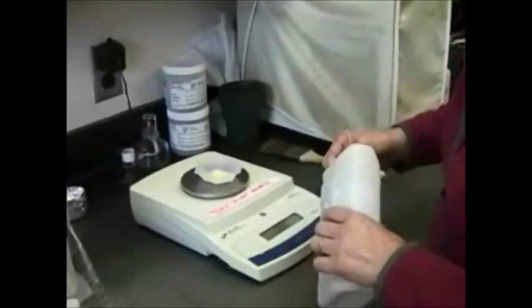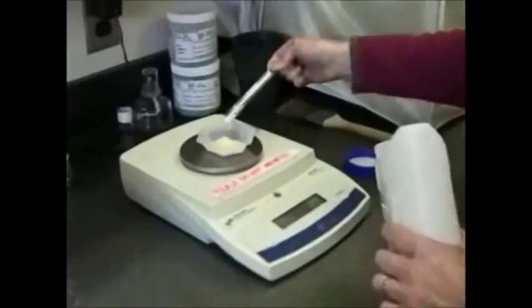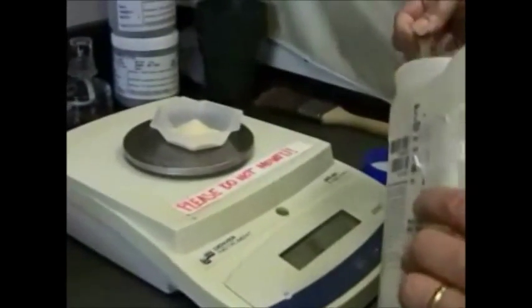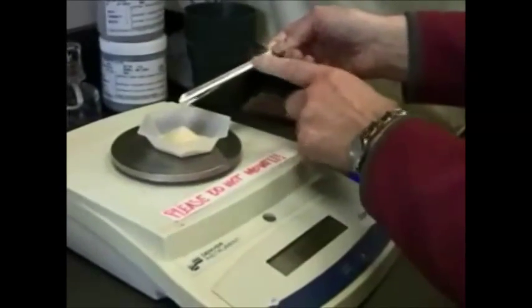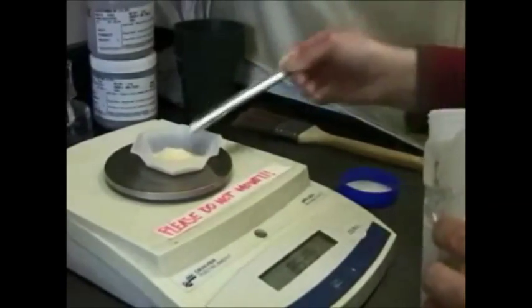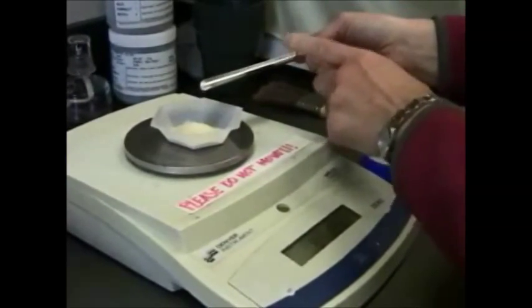It's a half liter, so it's 8.5 grams of the cornmeal agar extract. Almost got it. That was the technique, just to get a little bit. Sometimes you get too much and you've got to go back and try again. Just get the right amount.